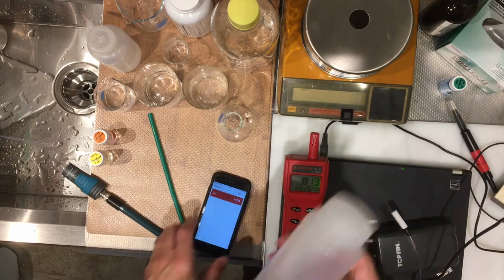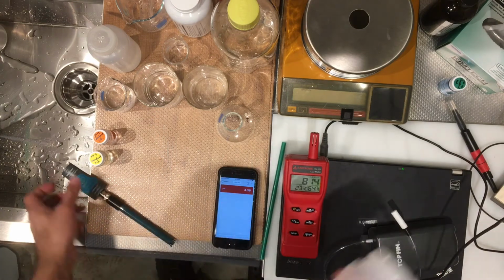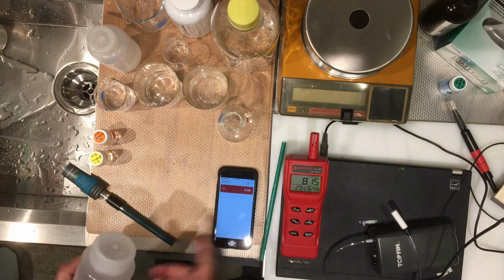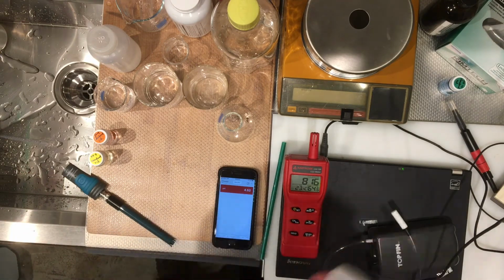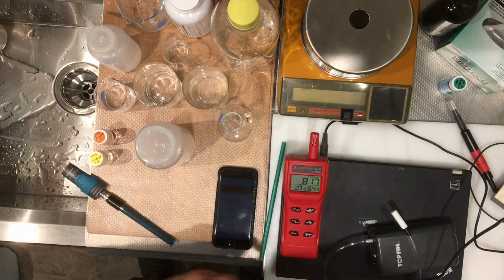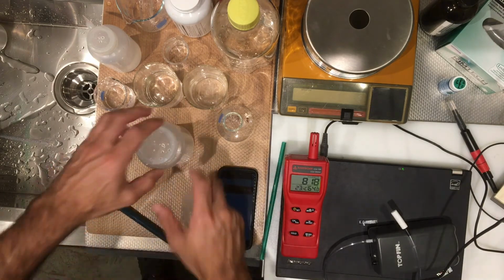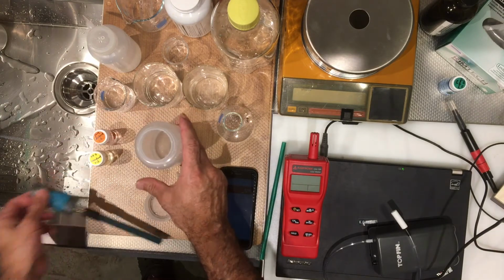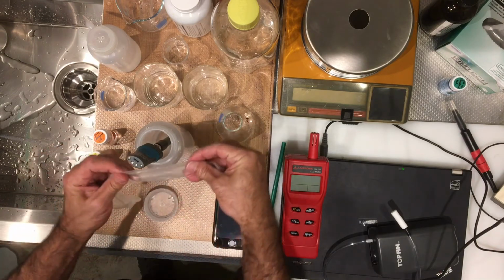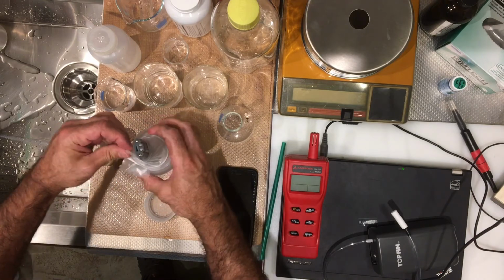So we're going to do that. My probe is sitting here, and I just need to insert it into here. My pH is measured on my iPhone app, and it's a wireless probe. So let's go ahead and do that. I also want to make sure that we don't lose the gas, so I'm going to cover this up. So there my probe is in, and I'm just going to cover this up here so that the concentration of carbon dioxide would not change as much.